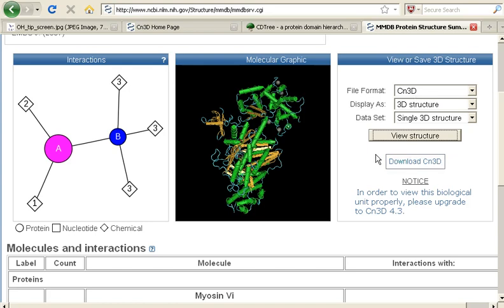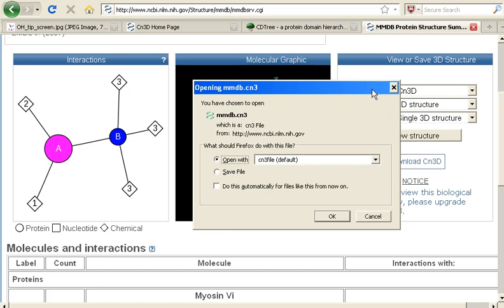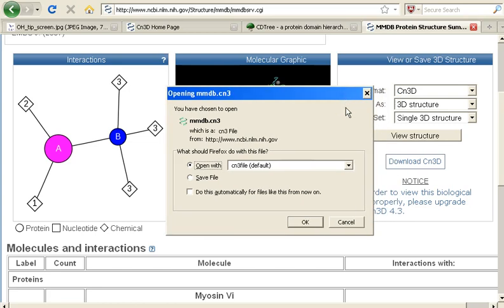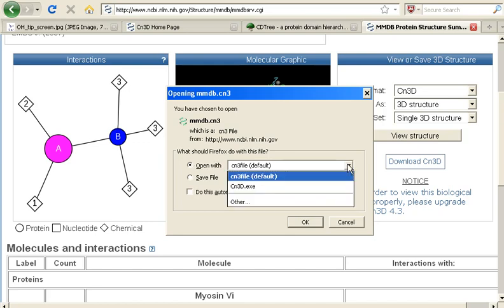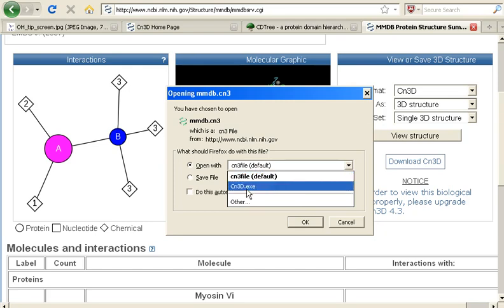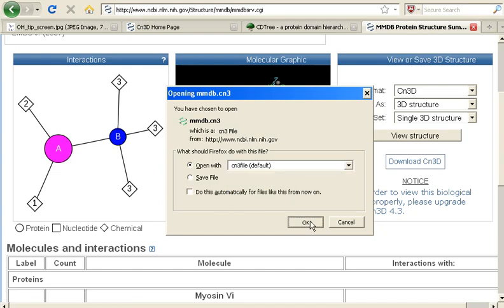If you haven't downloaded the software already, you'll need to click this button. I already have downloaded it to save a little bit of time. So, I'm going to click the view structure button. I'm using Windows, so I get this window that asks me what software I should open the file with. Because I have both the 4.3 version and the 4.1 version of the CN3D software, I actually have two choices. Default will open the file in the 4.3 version. The .exe is the 4.1.